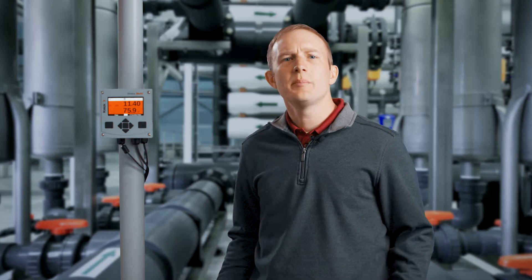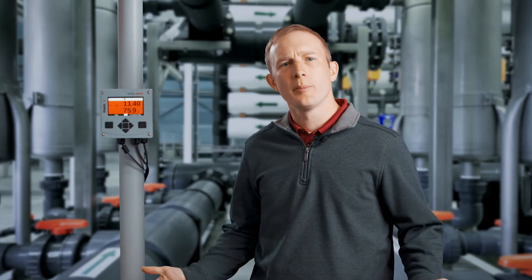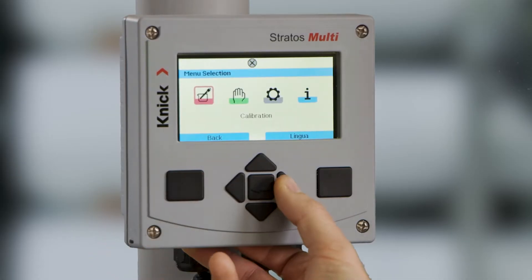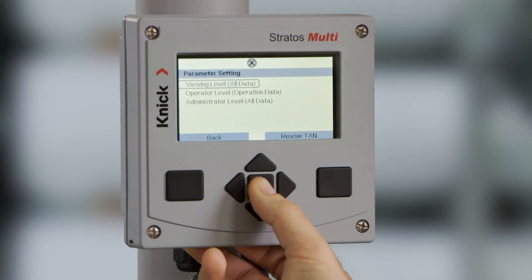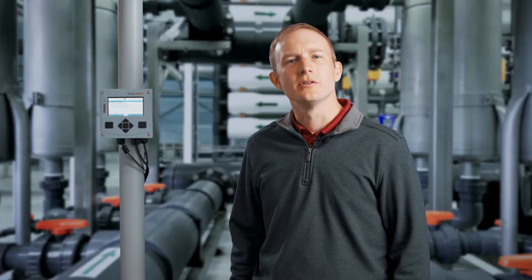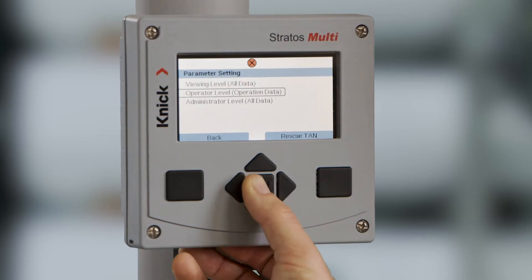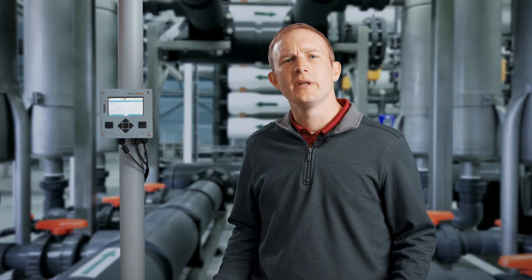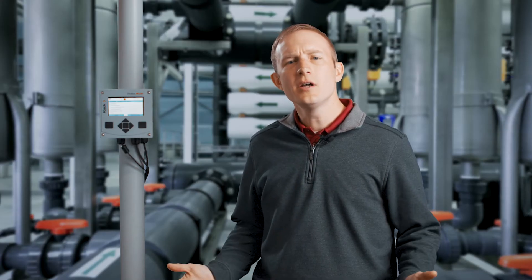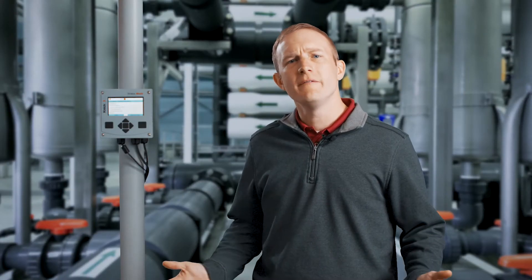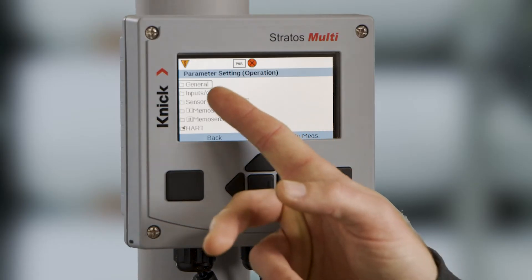Let's get started by entering the operator level of the parameter setting menu. First, press the menu button and then toggle to the right to parameter settings. After pressing enter, scroll down to operator level and press enter to go into the menu. If prompted for a passcode here, please note that the default is 1246.